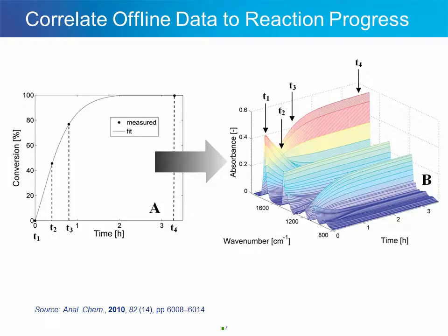The absorption at 1720 wave numbers corresponds to the carbonyl vibration of the acid functional group, which represents the decreasing amount of myristic acid. The carbonyl vibration of the ester functional group absorbs at 1750 wave numbers, representing the increasing amount of product. It's important to point out that you can visually see a range of frequencies that change across the fingerprint region as a function of conversion, making this system ideal for chemometric analysis.